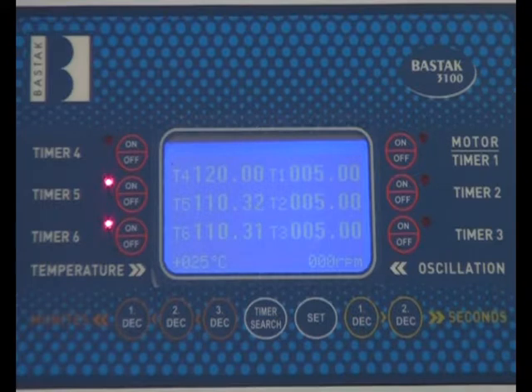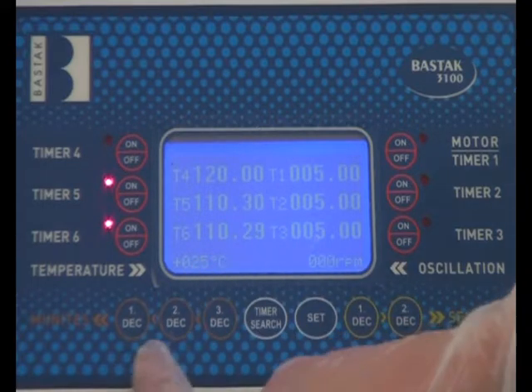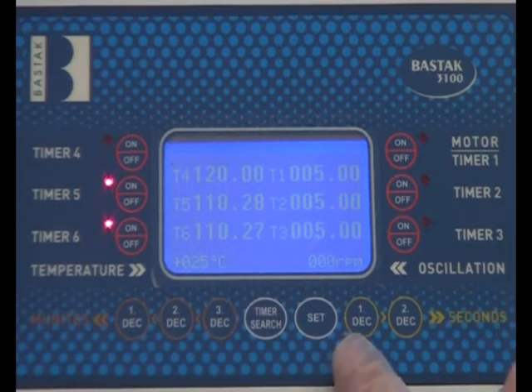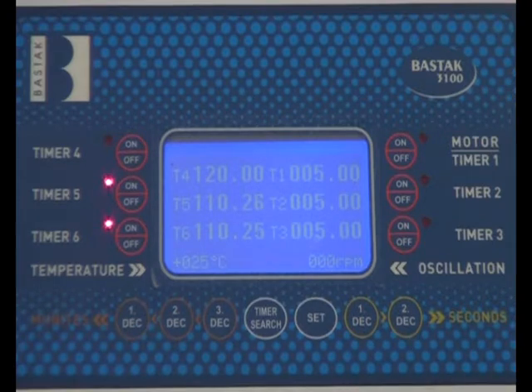It has an LCD screen. On the screen there are 6 independent timers with the first 3 digits representing minutes and last 2 digits representing seconds. To control the active timer, there is a lamp near every timer.